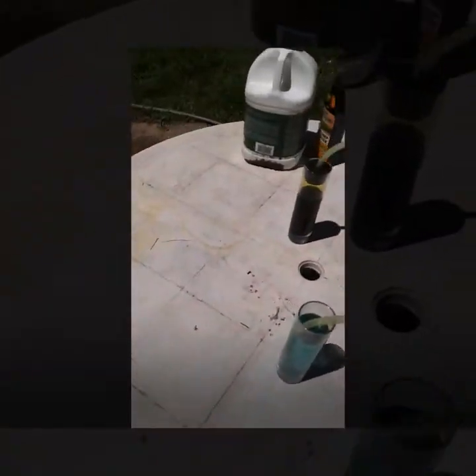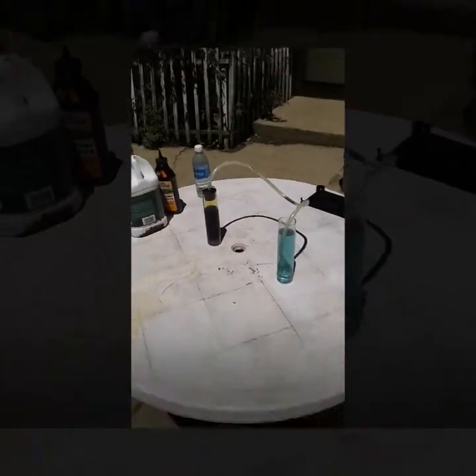Let me try to get a better picture — put it towards the sun. I can barely see the bubbles coming up in that vial on my screen, but that is how you make nitric acid.